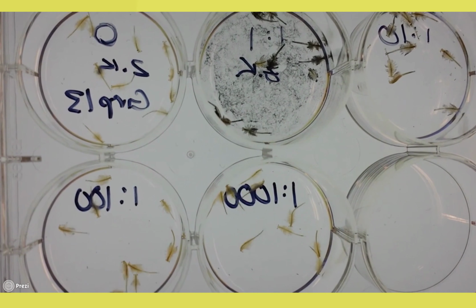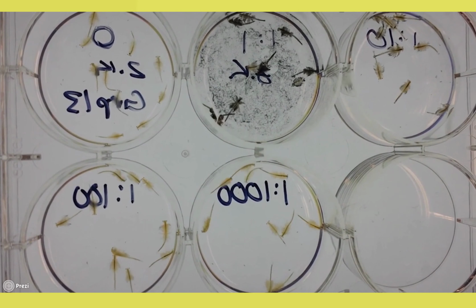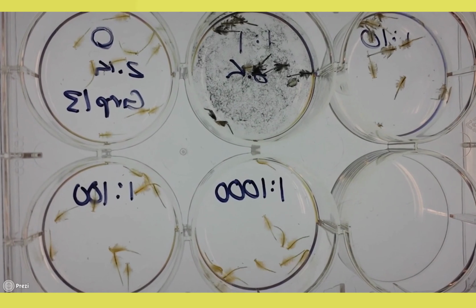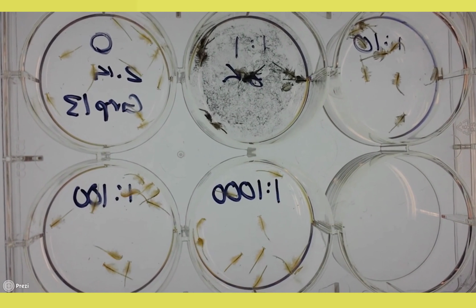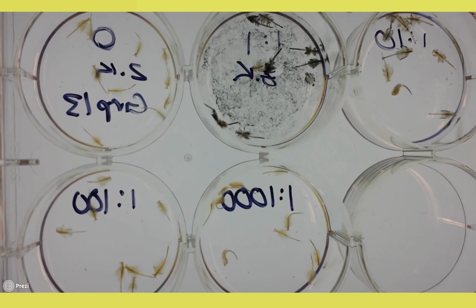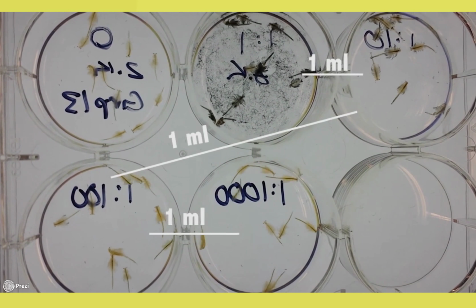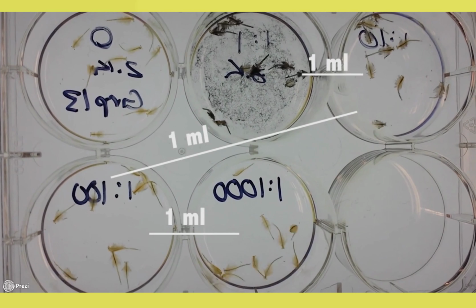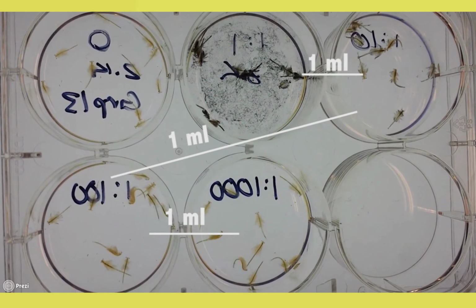The design included 5 test tubes with concentrations of 0, 1-to-1, 1-to-10, 1-to-100, and 1-to-1,000. The first sample included 2 milliliters of seawater, while the second sample had 1 milliliter of seawater and 1 milliliter of the iron oxide solution. Every successive tube after that has 9 milliliters of seawater and transfers 1 milliliter from the previous tube. So for example, 1 milliliter of the 1-to-10 solution was used in the 1-to-100 test tube.